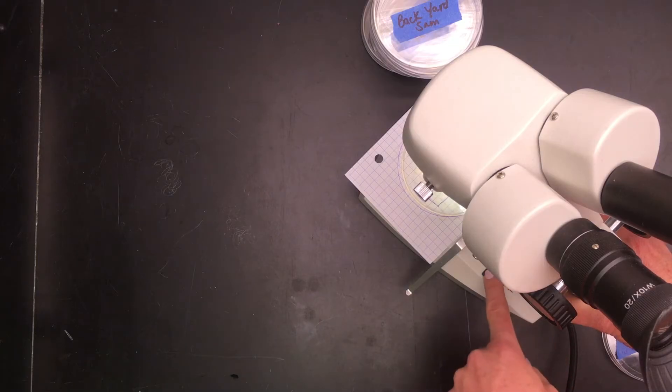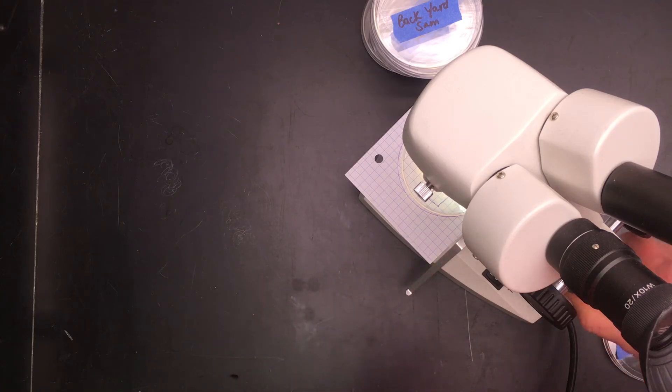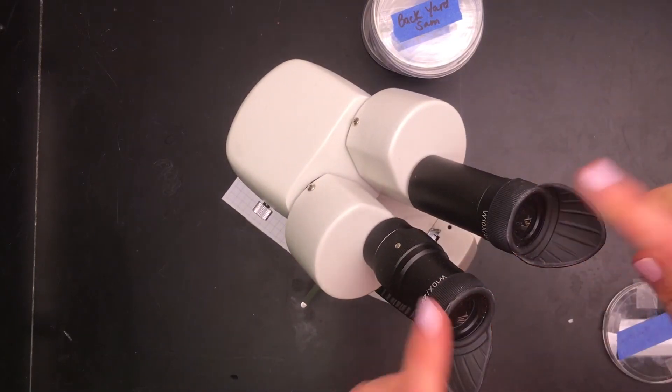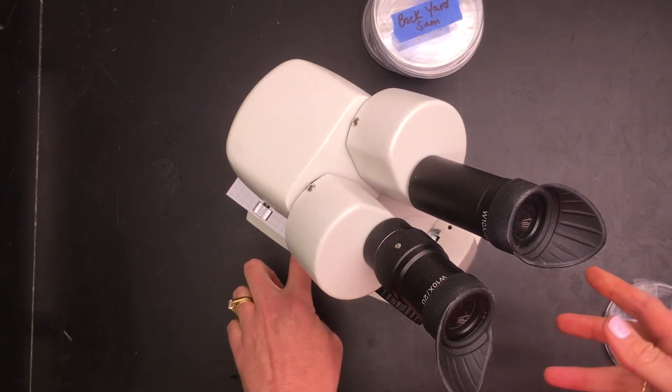There's settings on the stereoscope for different light intensities, so play around with whatever light intensity you want. Once you have decided your light intensity and make sure it's the same for all of the dishes, then you're gonna look through the eyepieces and count the number of particulates in the squares on your template.